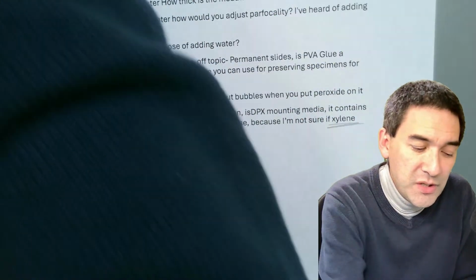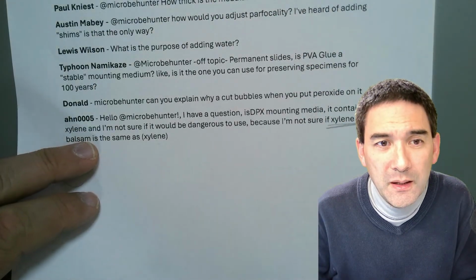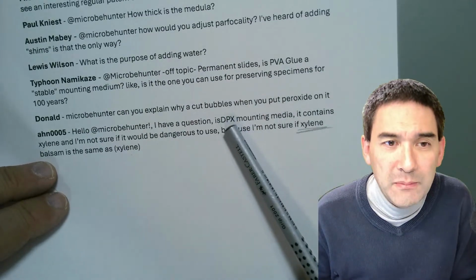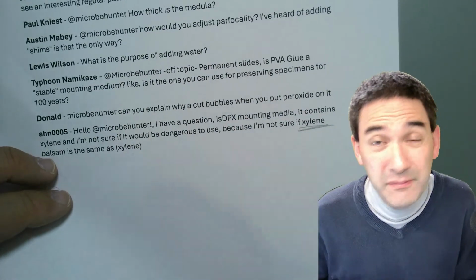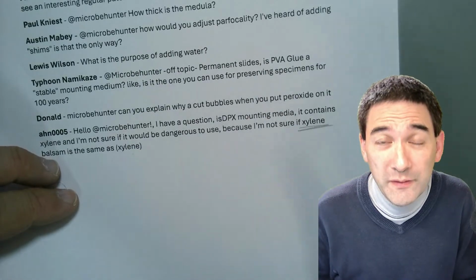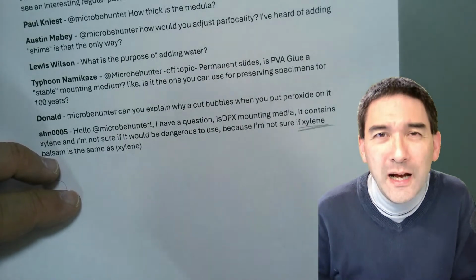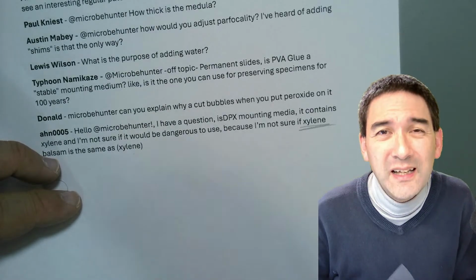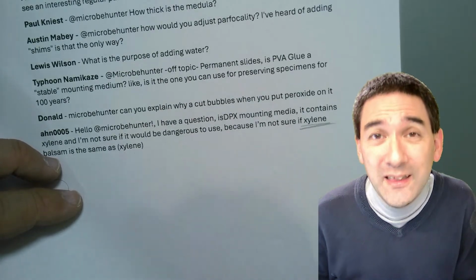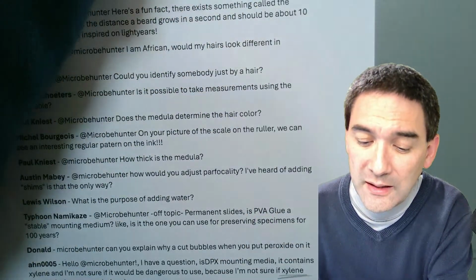And if you want to prepare specimens with xylene, like certain resin-based mounting media like DPX and even UKit, which I also have, which contain solvents like xylene, then you have to make sure that the specimen is completely dehydrated and free of water, right? And that's already quite a lengthy process. So making those histological slides like the monkey tail that I have here, right?